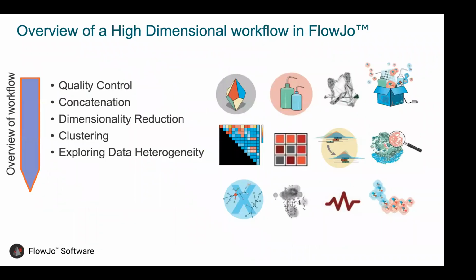Of course, there's no dogmatic workflow, so you can adapt it according to your needs and have your own workflow. For example, if you do not need any quality control, if you have very clean samples, then it's great to go ahead and perform no quality control there, right? But here I propose a workflow that we use very often, that in most of the cases and most of the data sets can be applied.